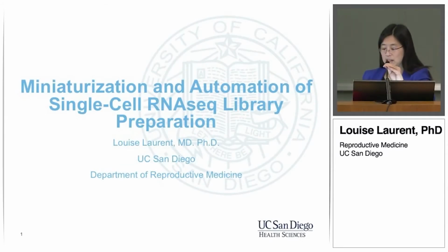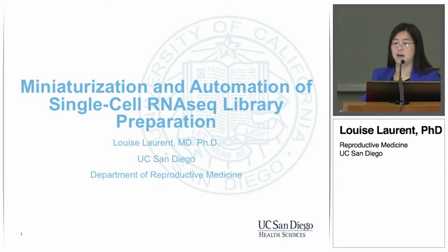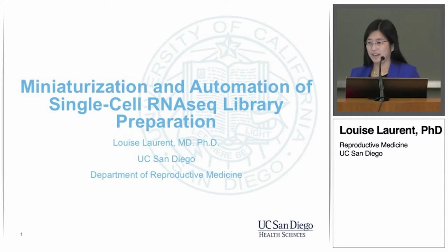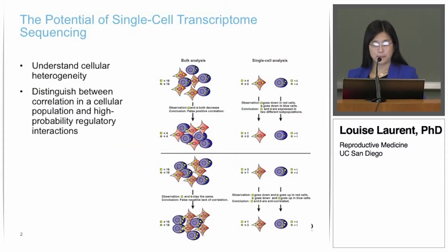It's been fun working with Sonia over the last couple of years. We came to her with the goal of automating and miniaturizing our single-cell RNA-seq pipeline. It's been a lot of hard work on her part and on the part of folks in my lab, and I think now we're just seeing the interesting findings out of it. So basically this walks you through our experience with adapting our pipeline to an automated system.